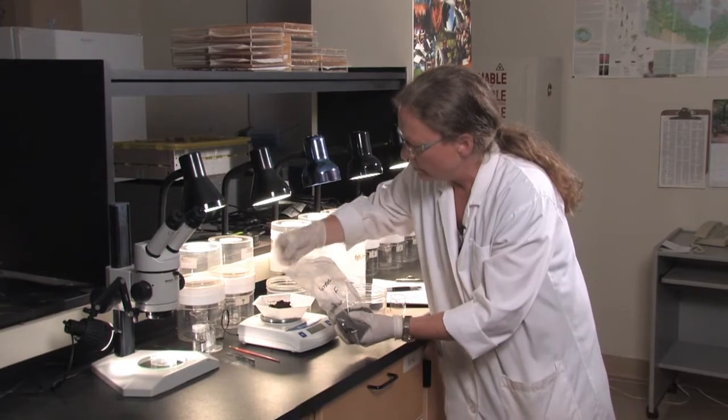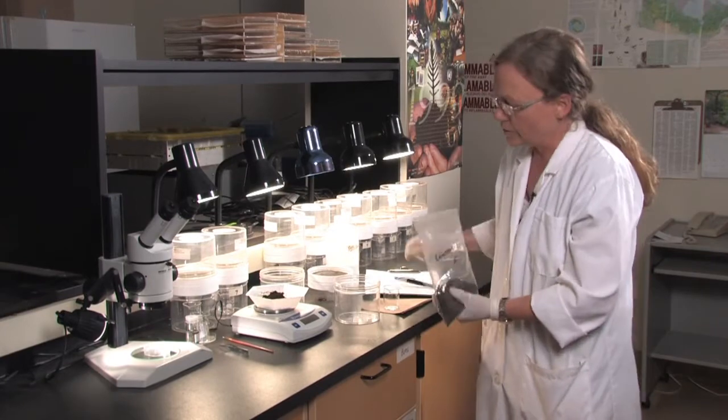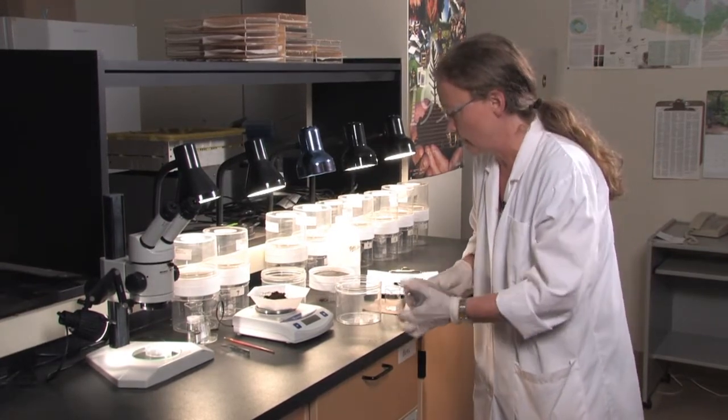Once you've weighed your soil, make sure you write down your data and then we are ready to place it in the extractor.